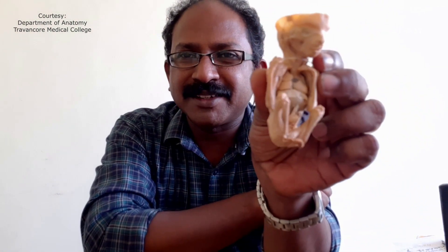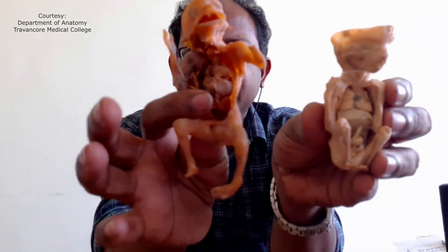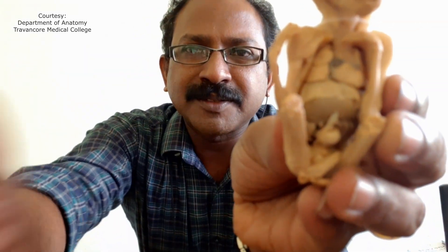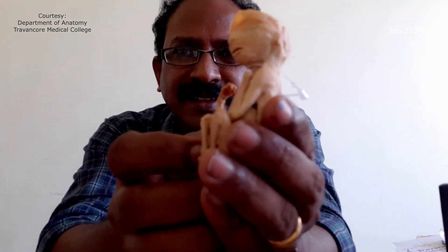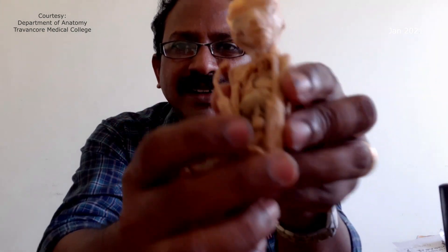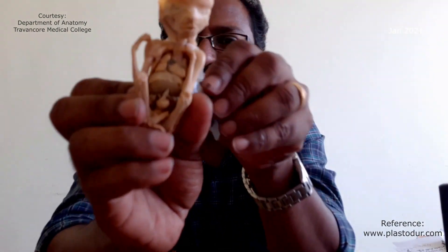I will show you another successful specimen. This I have done some 4-5 years back and you can see the difference. This is polyester resin and this is silicone — you can see the internal organs. The muscles of the face, the texture is very clearly seen. There is no discoloration. All the texture, all the contour, everything is very perfect in this specimen, plastinated with silicone.